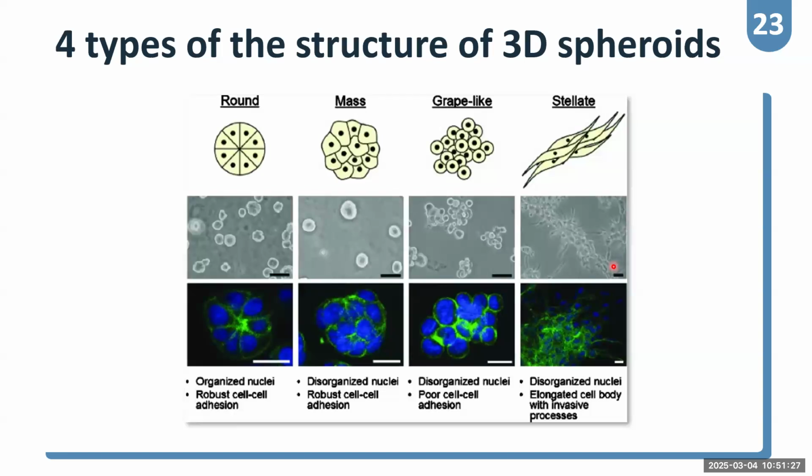If you see elongation legs or body like this, it can refer to the cell's ability to migrate through the matrix gel. Okay, if they just go in a round shape but it's bigger, it shows the capability of cell proliferation. But if you see the cell with legs like this, with spines like this, it means that the cell can invade or migrate through the matrix gel.